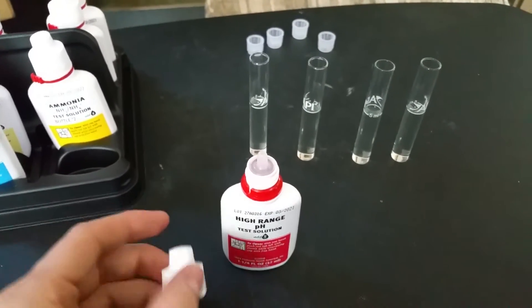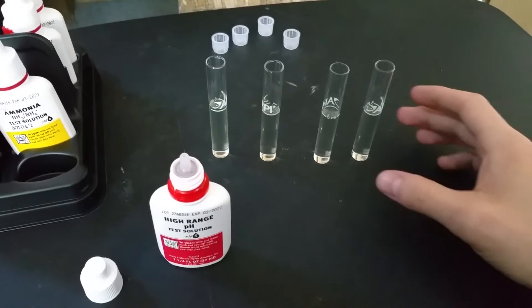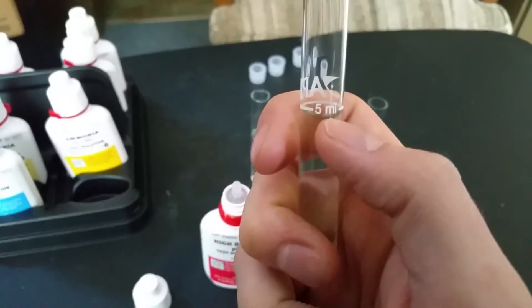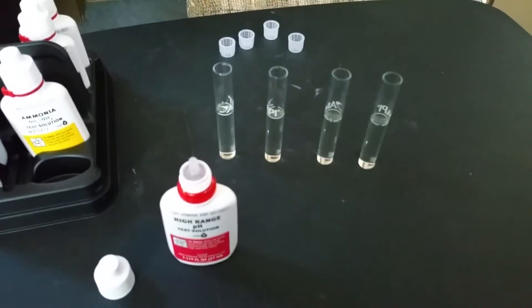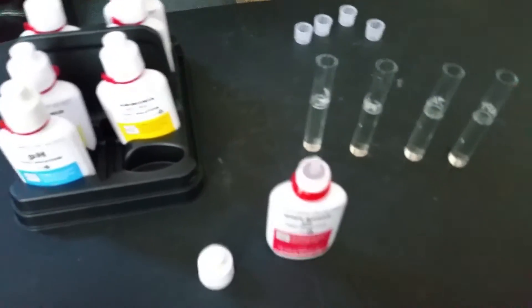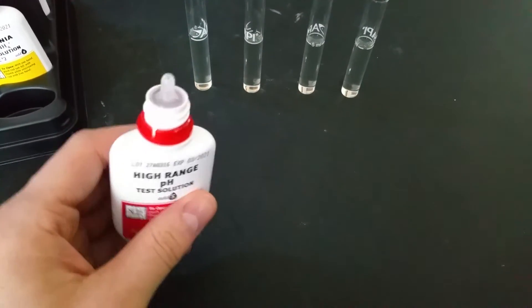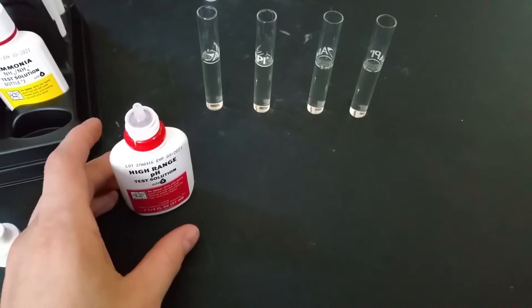We're going to start out here with high range pH. First off, you want to fill your test tubes up to the 5ml mark with your tank water. Now this test kit only comes with 4 test tubes, but it comes with 5 different tests.